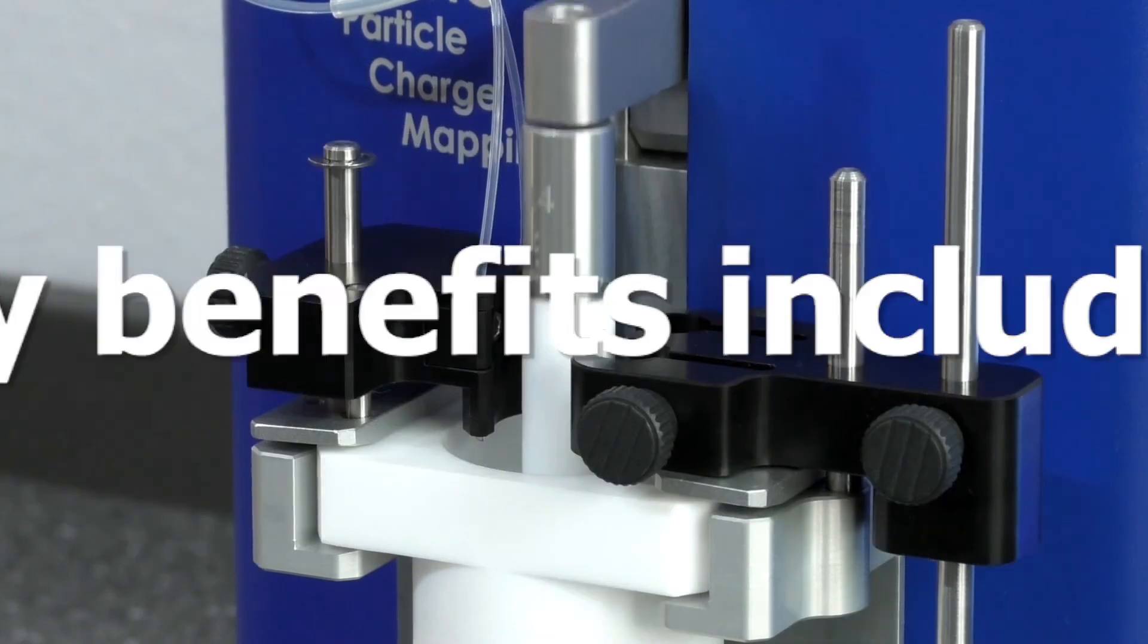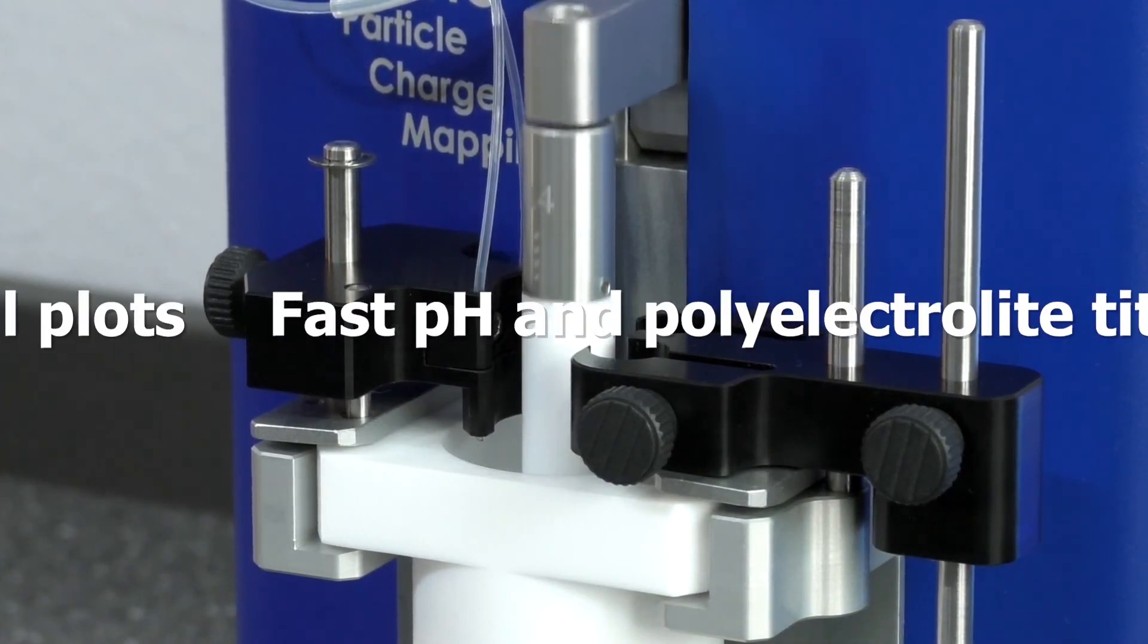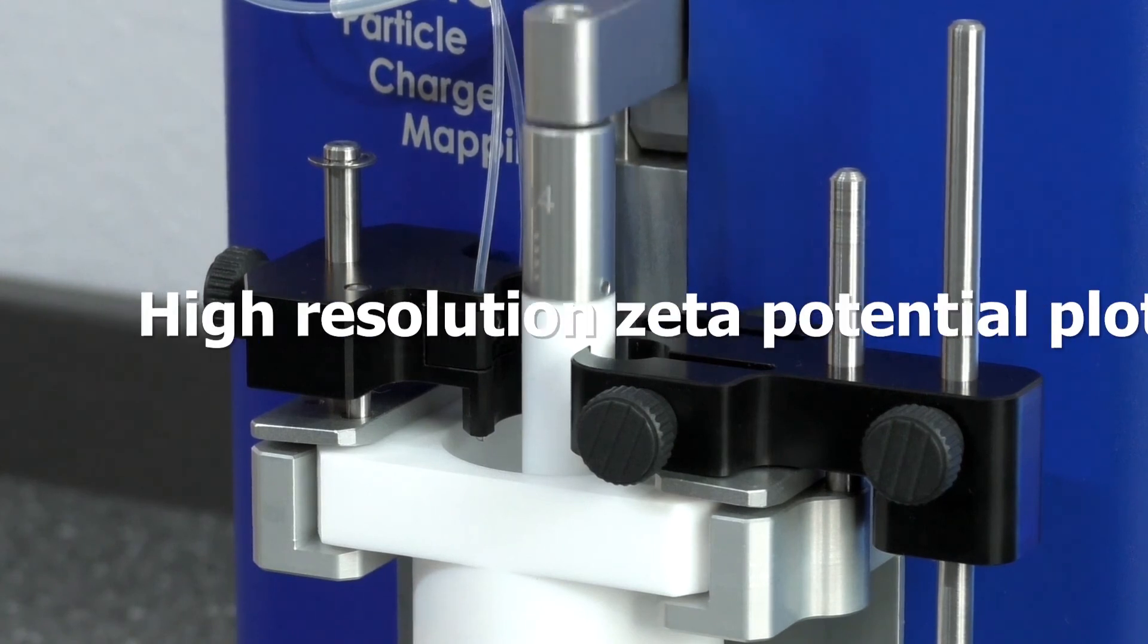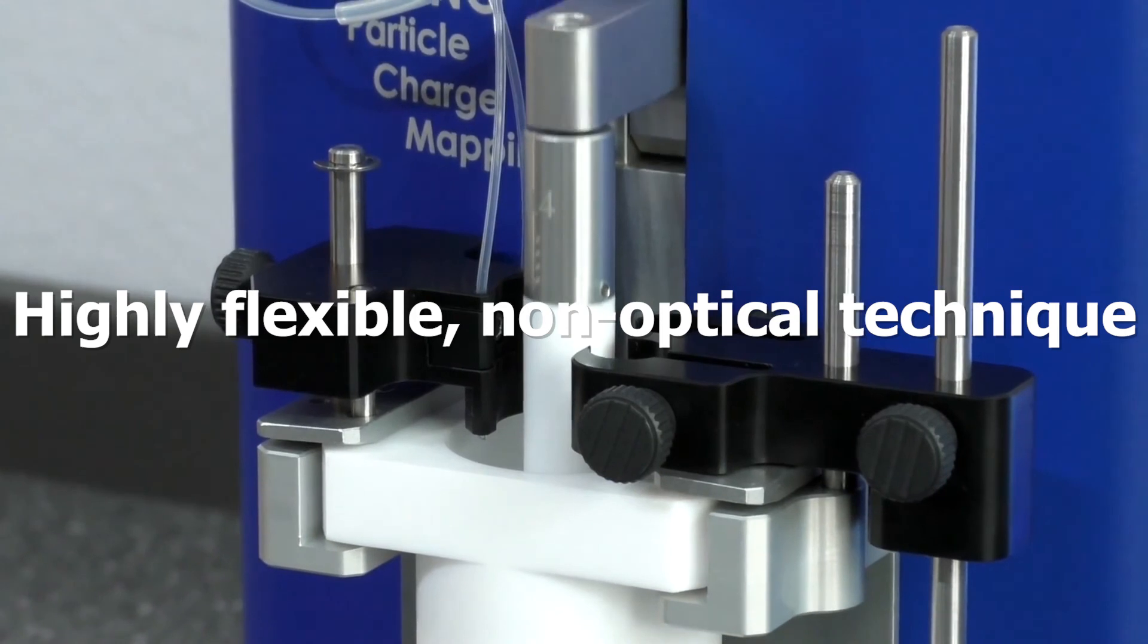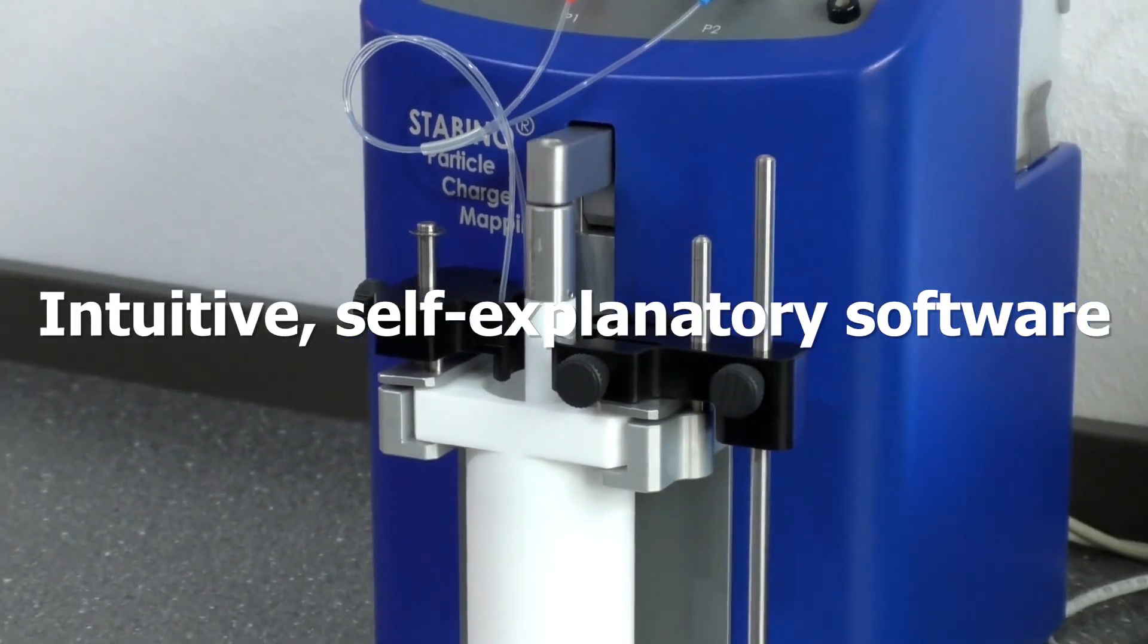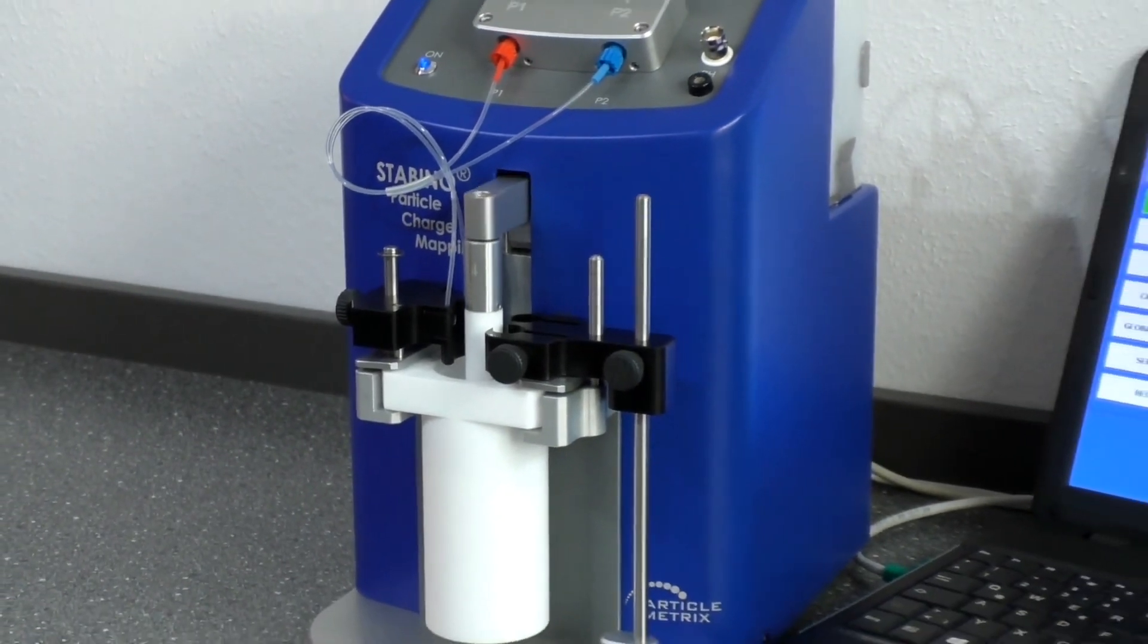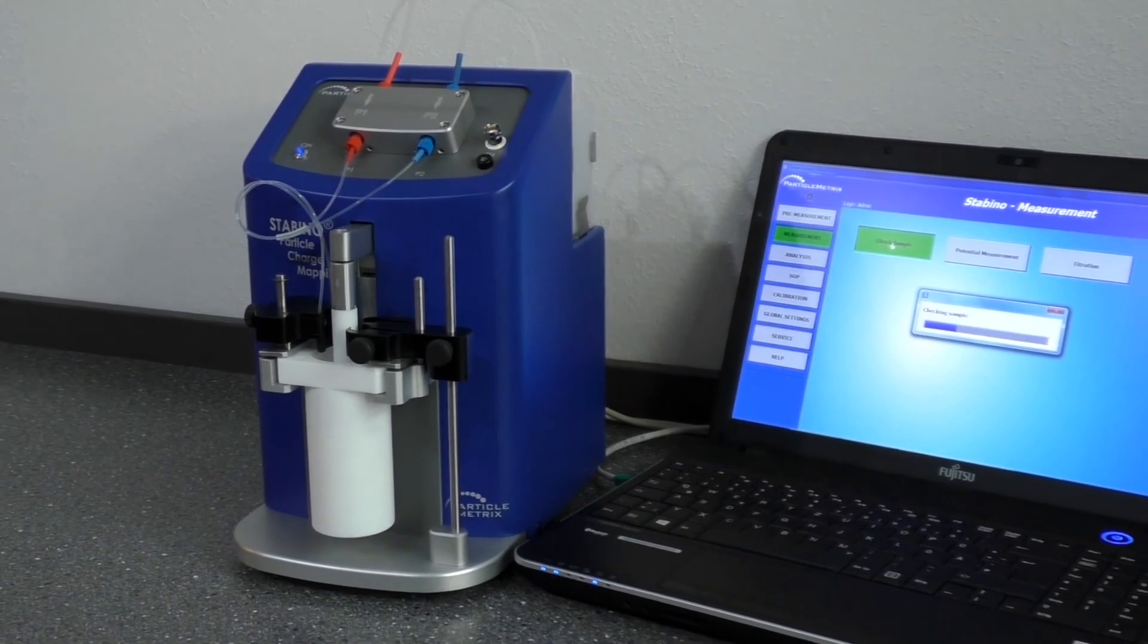The Stabino has a number of key benefits. These include fast pH and polyelectrolyte titration, high-resolution zeta potential plots, the ability to use the mix and measure principle, its highly flexible non-optical technique, and its intuitive, self-explanatory software. The system is ideally suited for formulation development and also has applications in quality control.